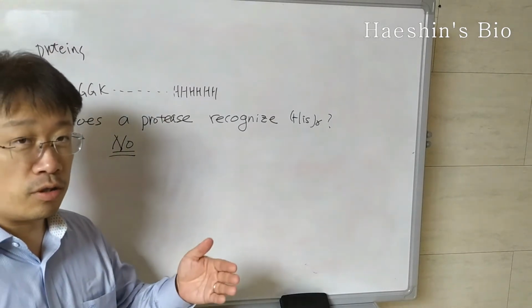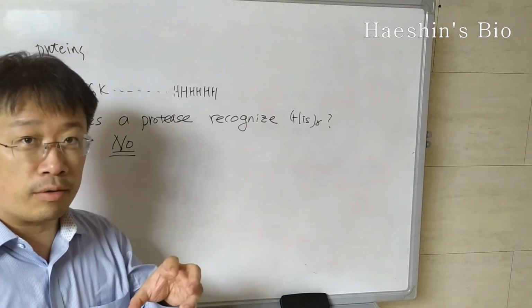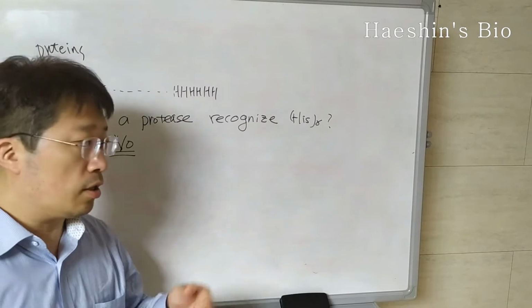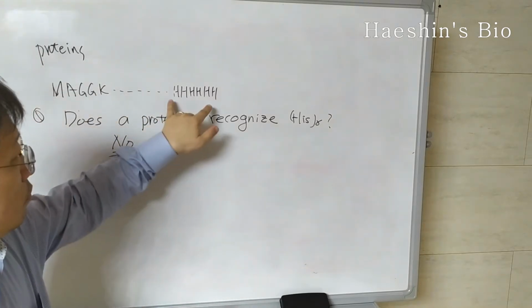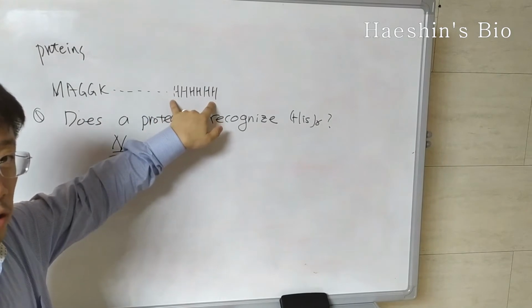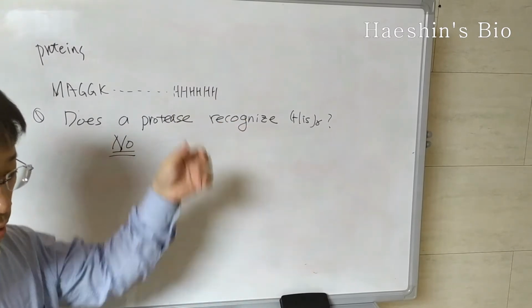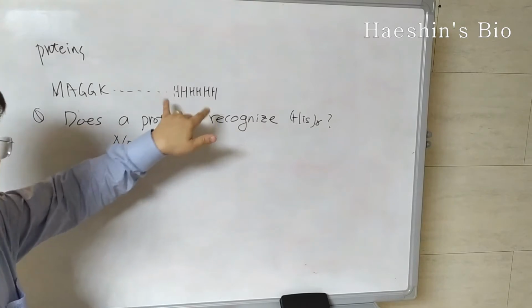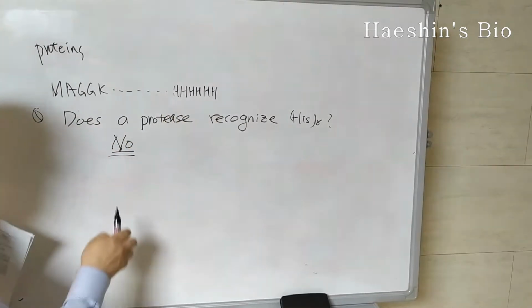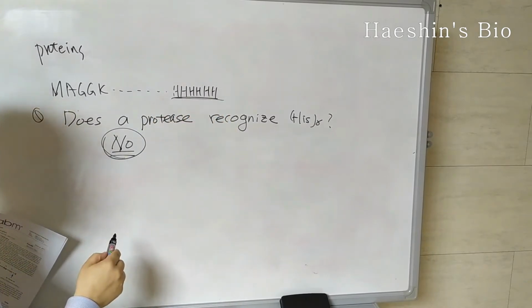I mean, if you can use ion exchange or gel filtration chromatography or salting out, which we will mention later on in this topic, that's fine. But with a histidine tag it seems easier to purify the protein: you bring out the NTA resin, pour the solution, and then purify the protein. But the tag has to be removed. That is the challenge. There's no protease that recognizes this histidine sequence.